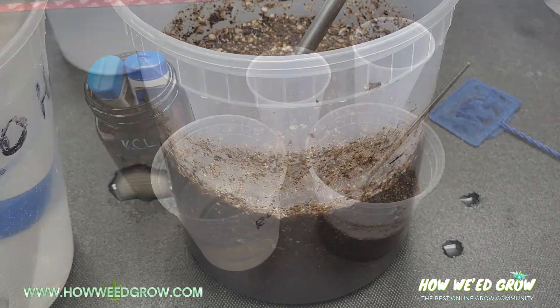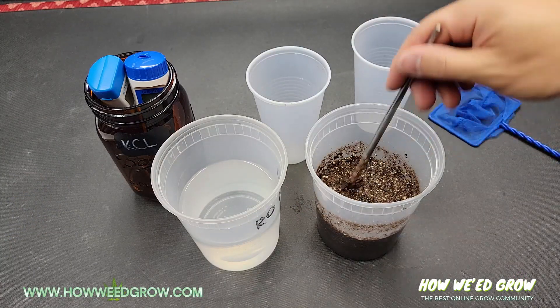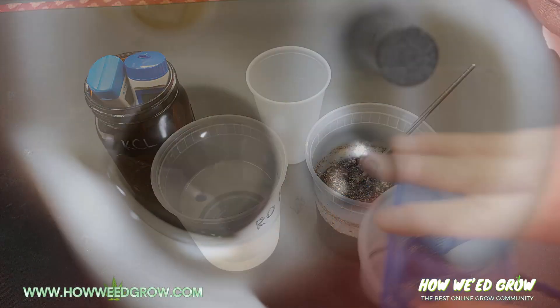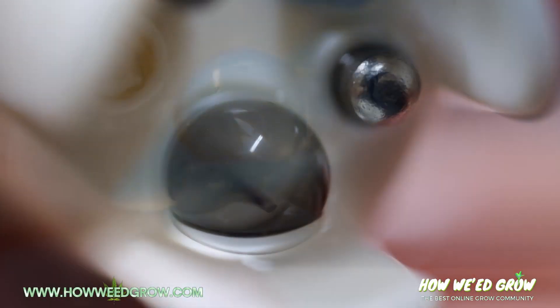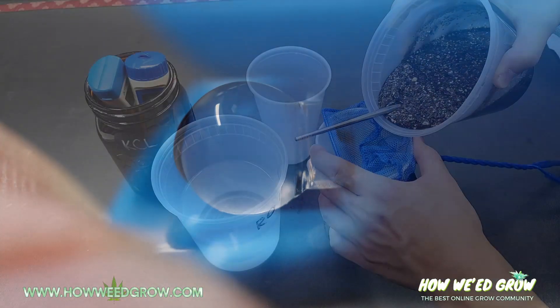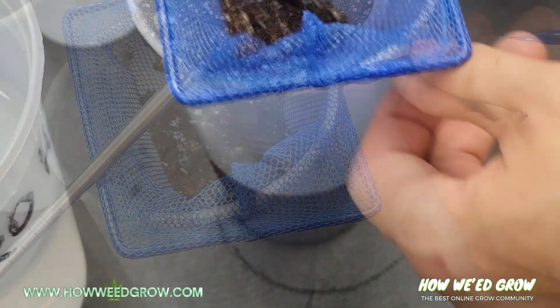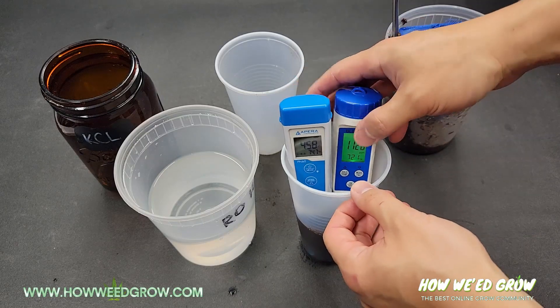This time allows the soil to fully saturate, and after the wait, give the slurry one final stir. Now you want to take this slurry and strain it into a clean cup. The reason we strain is because we don't want any abrasive solids brushing against your pH meter's probe, which could damage it. You only need enough water to fully submerge the probes, so once you have enough, place your pH and TDS meters in, and after the readings stabilize, record your readings.